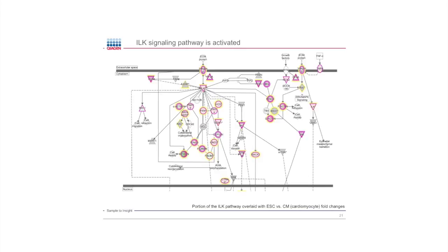Is there an annotation key for the networks? Can we find it online or in the software manual? Yeah, there are. In the help manual, there's a description of the shapes: what circles mean, what triangles mean, what the lines mean. So there's a legend available in the help.